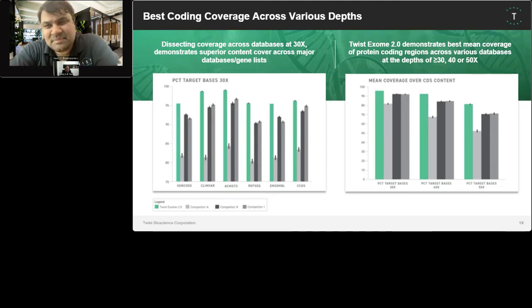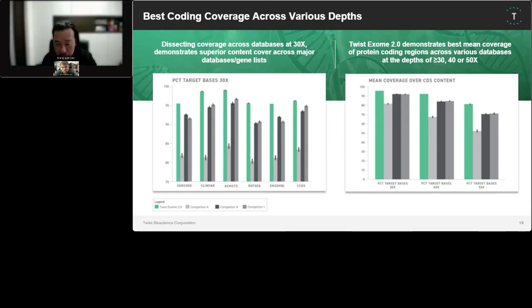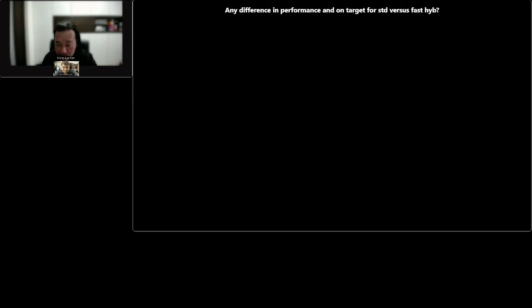Thank you. This is a very interesting question. Any difference in performance and on-target rate for standard versus fast hyb?